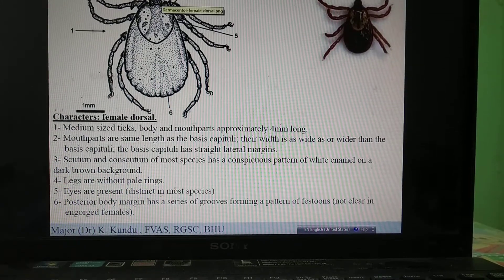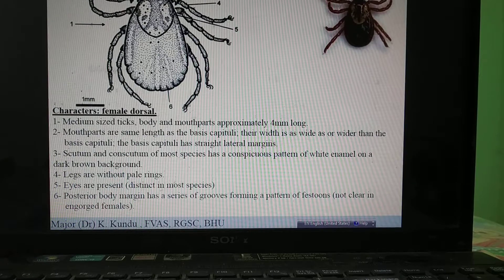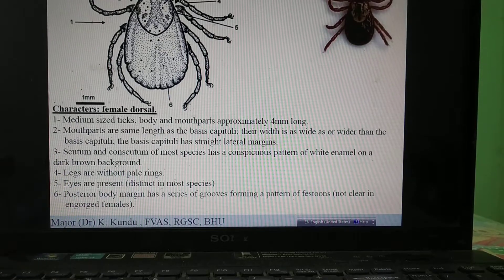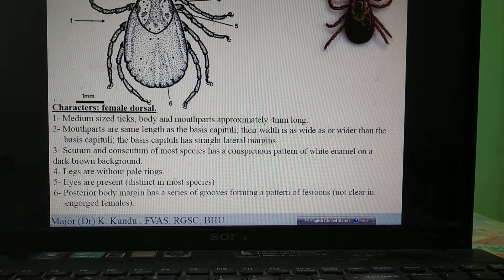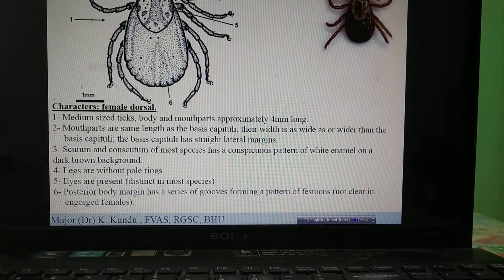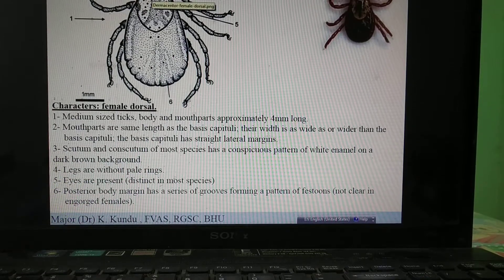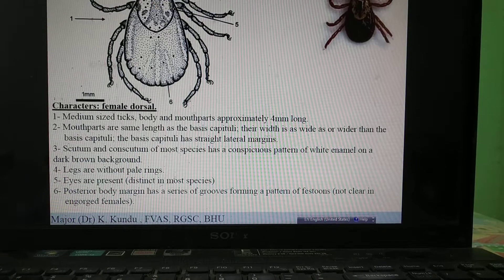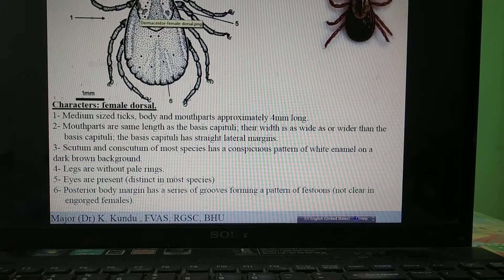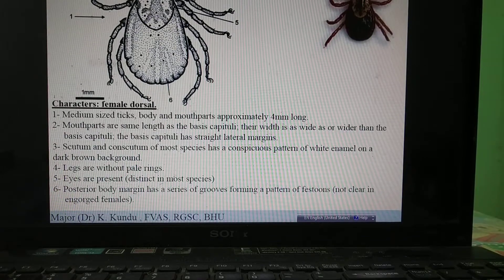The second important character is the basis capitulum — it is rectangular in shape in Hyalomma and Amblyomma. The eyes are present on the dorsal aspect of the scutum, but in Dermacentor the eyes are present on the lateral margin of the scutum.